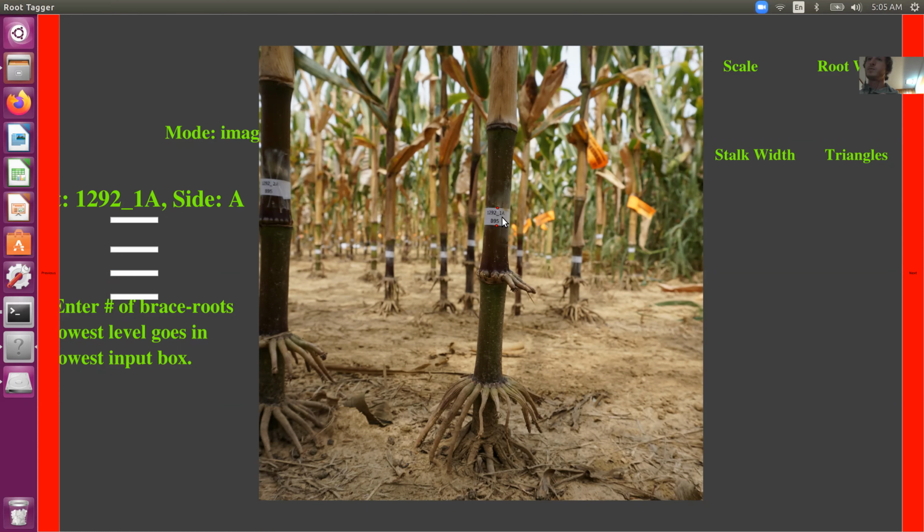Okay, so the image scale is the first thing, and you can see the mode kind of got cut off here, but when we hit enter, you'll see the mode pops up to the top, and the image scale, about 60 pixels, is going to get logged here.